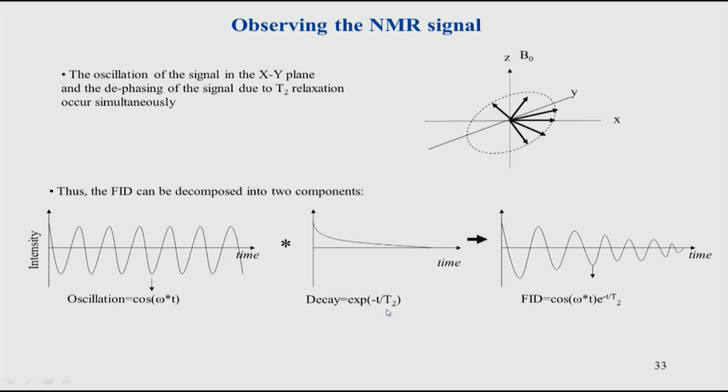So, this is the formula. The decay is exponential in nature, and it has a time constant, since every exponential function has a time constant, and that constant is T2 here. That means in 1 times T2 the signal would have come down by about 63%.